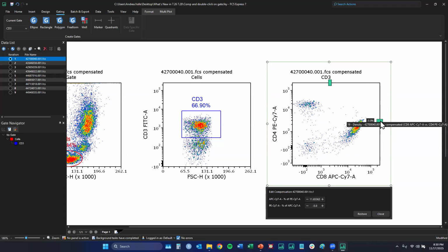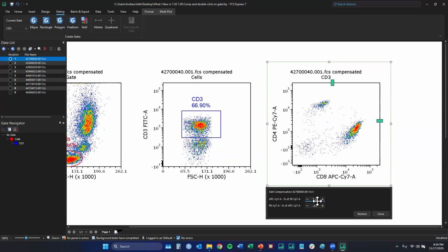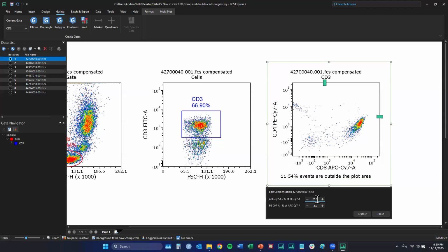You can act on the sliders. If you click on the sliders, then you can also use the up arrow on the keyboard. Okay, you can go up and down. That's also useful. You can type in, so let's say 5, okay, or 25. Of course, you can also type in decimals. You can also click on the spin edits here, okay? And we have the restore button.